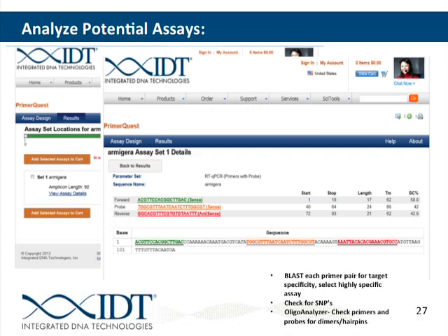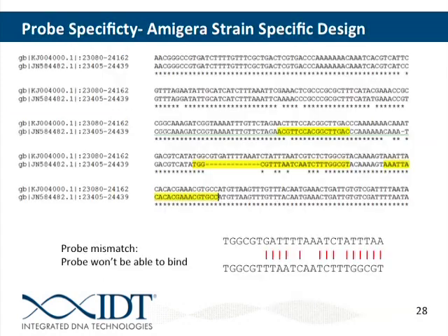There's a mismatch in the forward primer, so it's not as many mismatches as in our previous one. But the fact that this probe here is so different in the two sequences, this is a very good assay. So we can actually align the sequences as if this deletion wasn't present. If the probe was to lay down on that unintended sequence, you can see how many mismatches there would be. And so there's just no way that that probe is going to lay down.